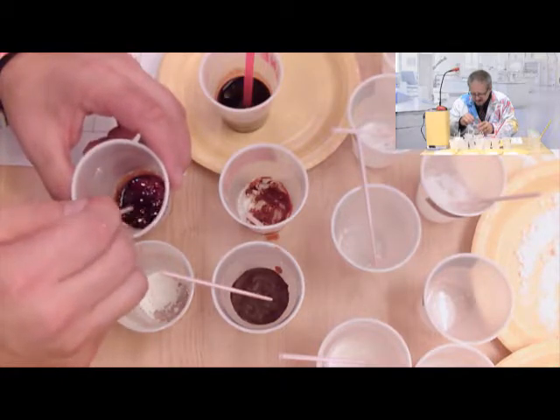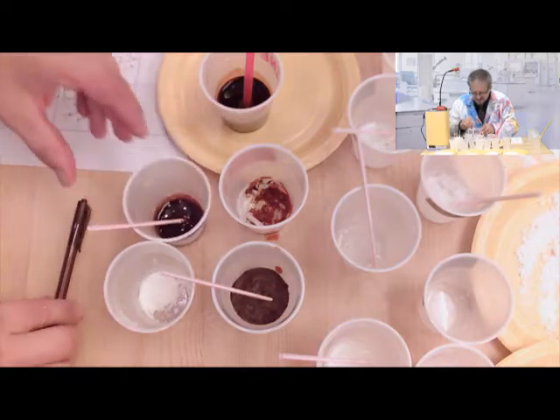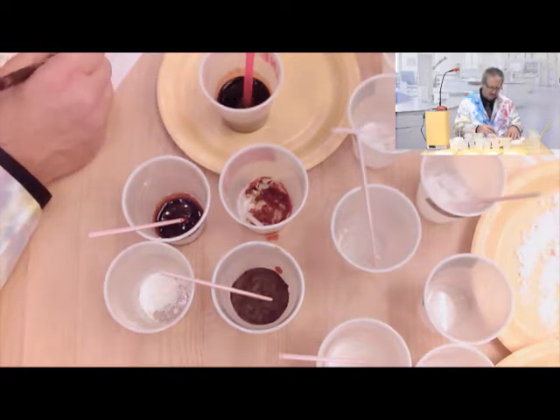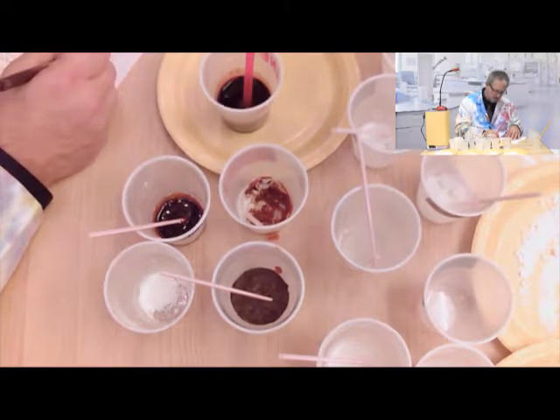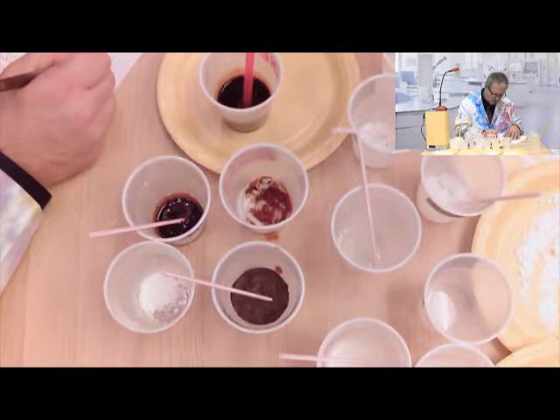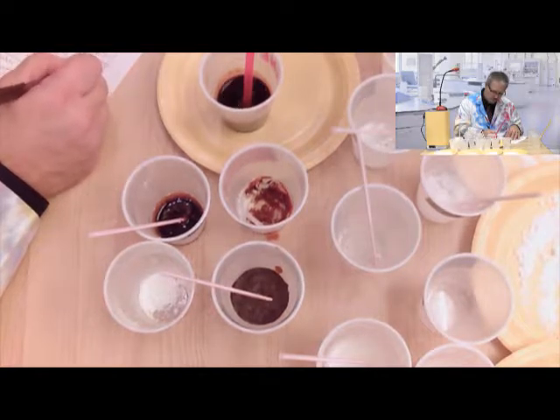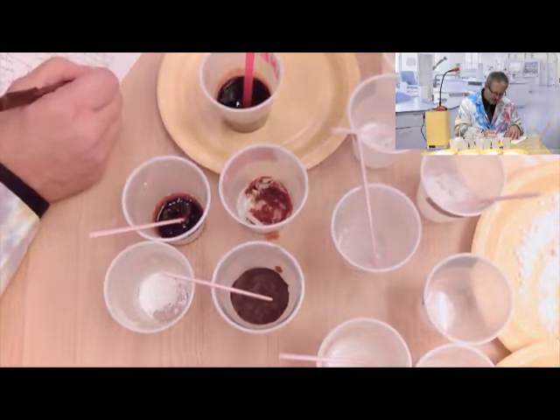Looks like some of the substance dissolved. Turned reddish brown.